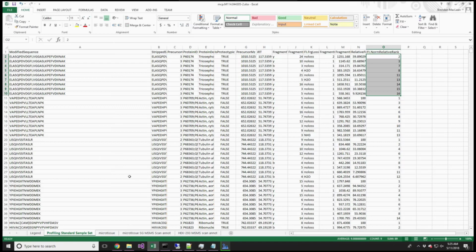So yeah, it's typical. In DIA, most people, if you're working with Skyline, you just include your Skyline document, then you have everything. But it's typical to include this library, because this is really the end result of, okay, this is what I'm searching. So you kind of have to include this. It's the transition list.